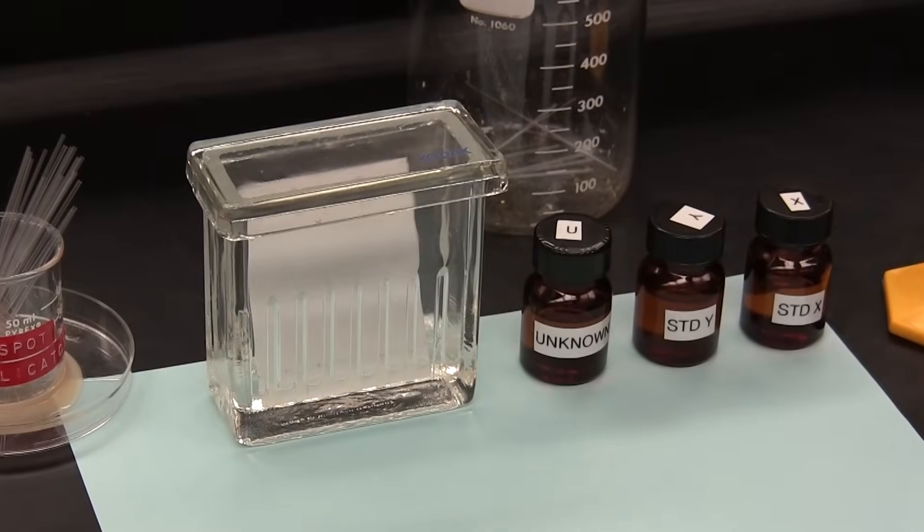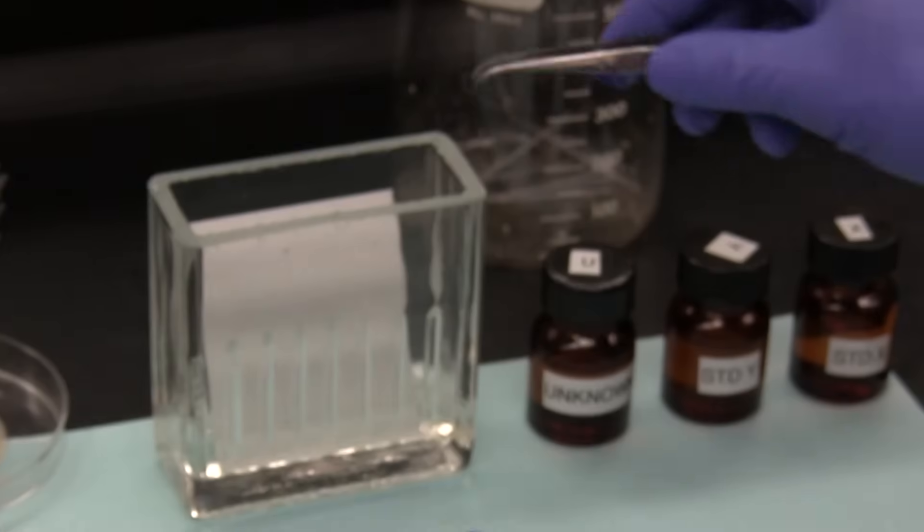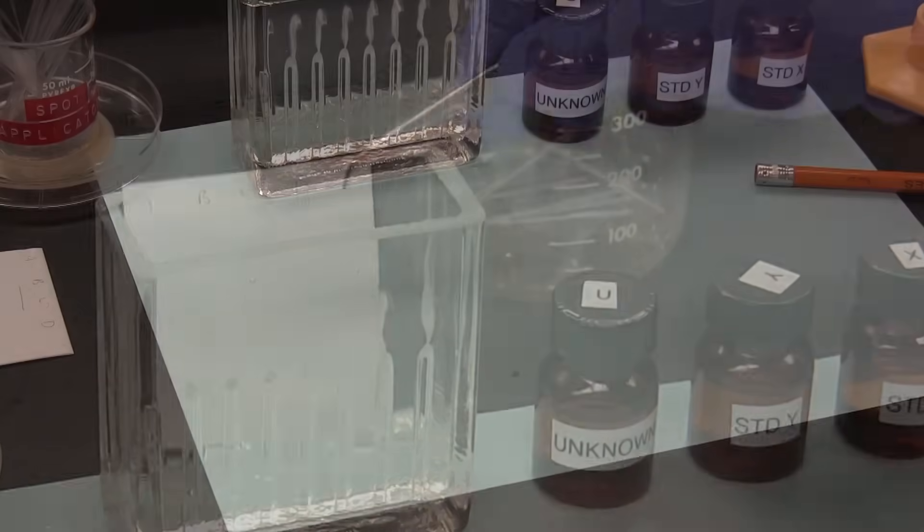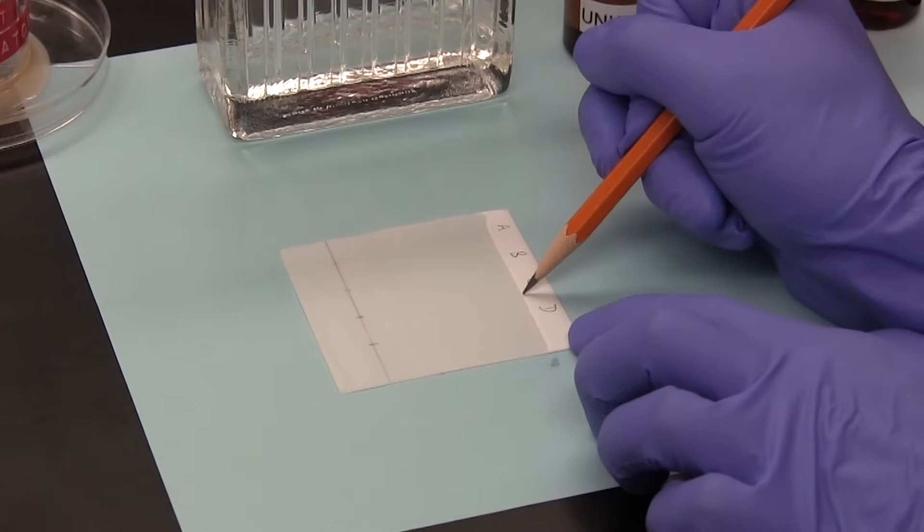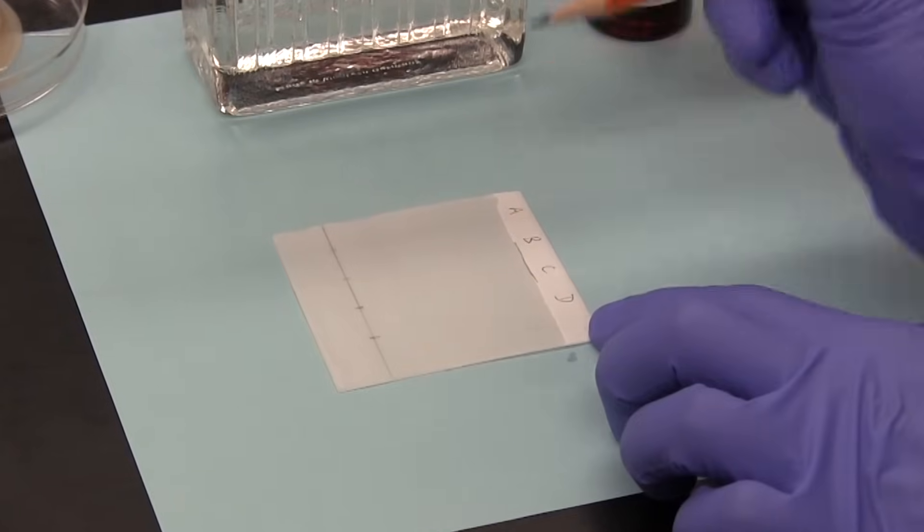When the solvent front is close to the top of the plate, say about a centimeter from the top, the plate is removed from the developing tank. And the solvent front is quickly marked with a pencil.